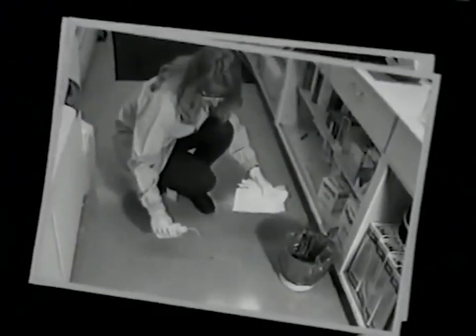The storage area should be constructed of smooth and easy-to-clean materials, and the reason for this is so that if there is a biomedical waste spill, and out of all the places for a biomedical waste spill, this is the highest probability of having a spill because you're bringing all of your waste to the storage area. So you need to have it easily cleanable or disinfected if there were to be a spill. Therefore, you cannot have carpeting in the area, and even if it is constructed of cement, you need to make sure the cement is sealed because cement itself is porous.